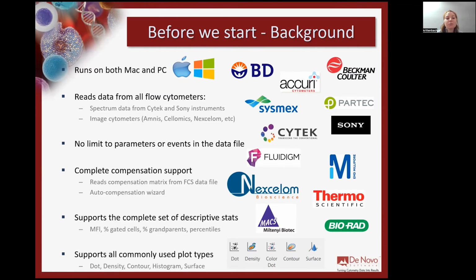And if you want to rerun compensation, or if you want to run compensation for the first time within FCS Express, you also have this auto compensation wizard available. I'm going to show you how easy it is to load in those single color controls and calculate compensation within FCS Express.